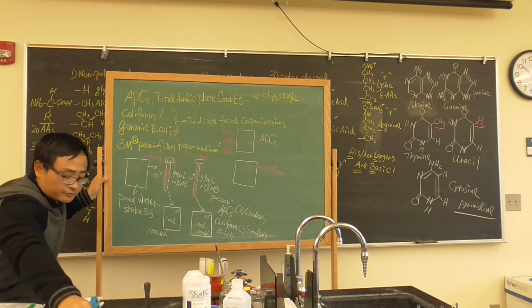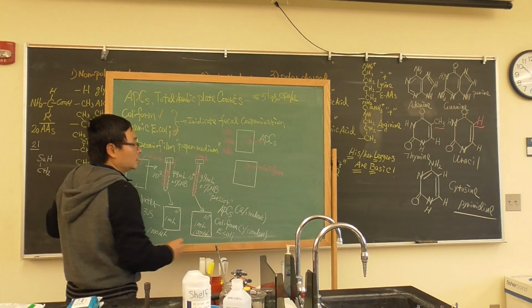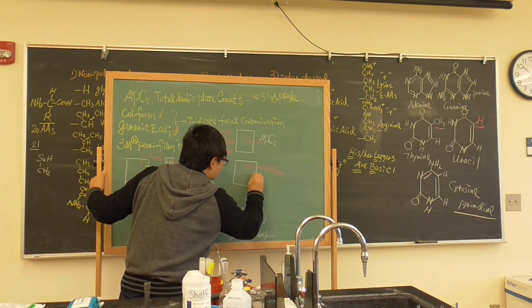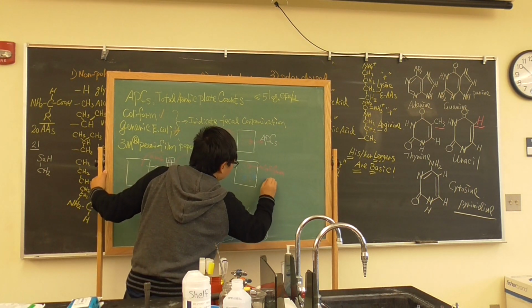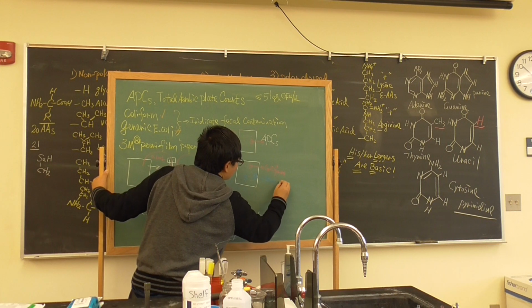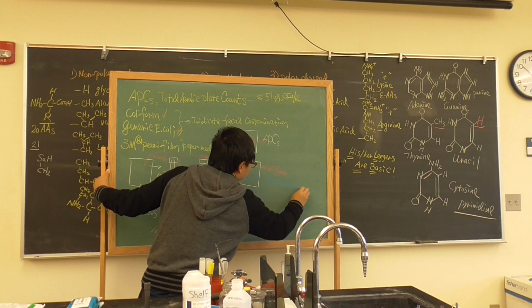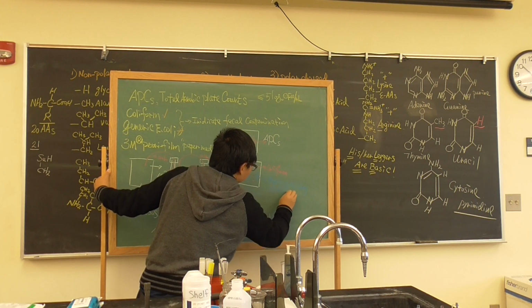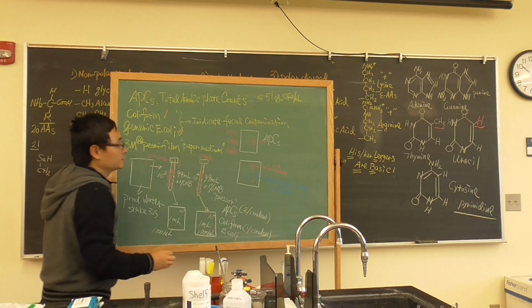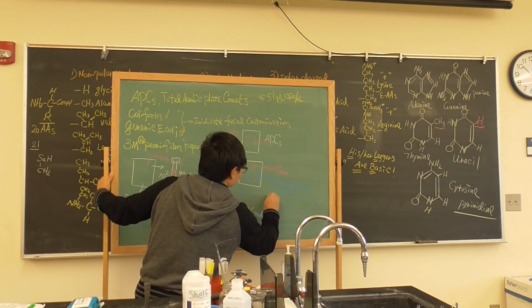And then if you see those red dots, a little bit purple, and they have like a bubble there. So we say blue to a purple colony with gas bubble. That is E. coli. That is generic E. coli.